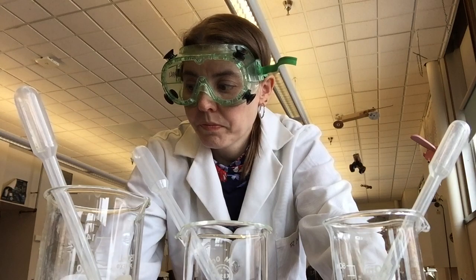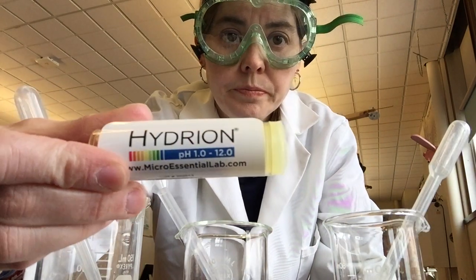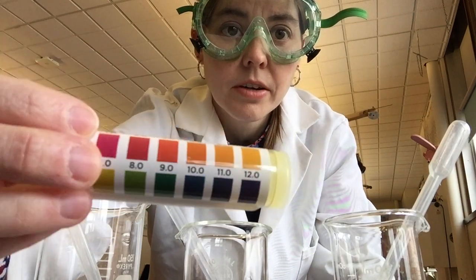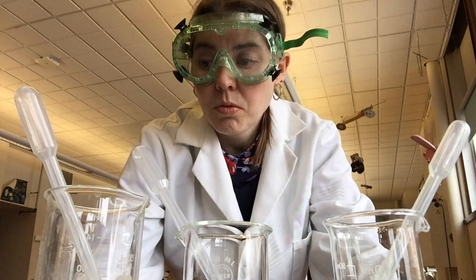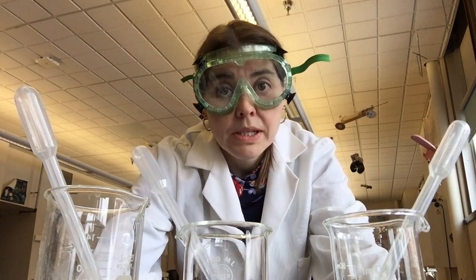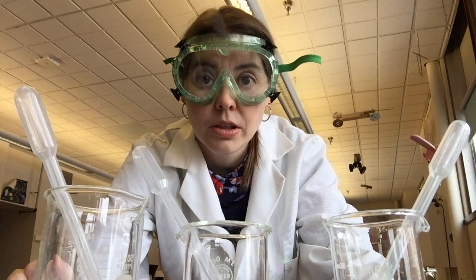I will use litmus paper — specifically pH paper, which gives me the whole range of whether something is acidic or basic on the pH scale. If it is acidic, it will have a pH of 1 through 6; neutral would be 7; and basic would be 8 through 12. Let's run these tests, see what colors we get, and figure out what each of my three clear liquids is.